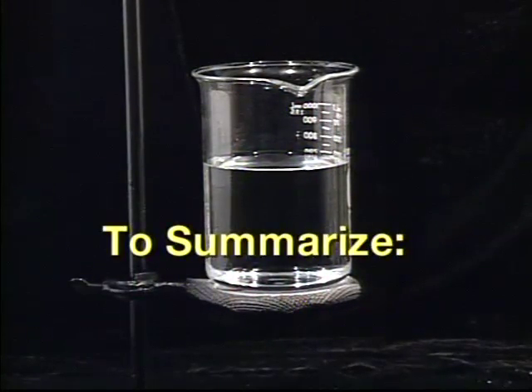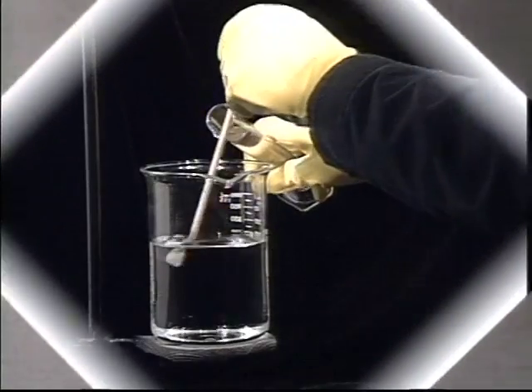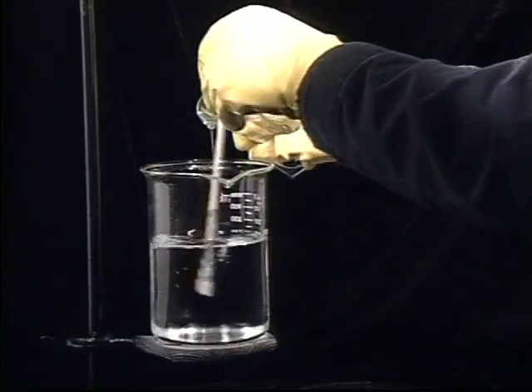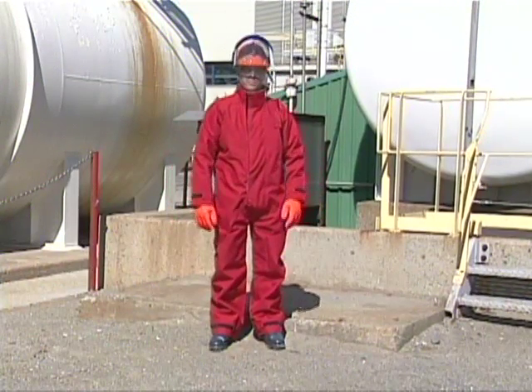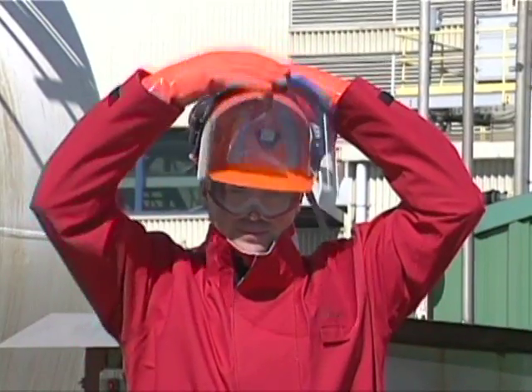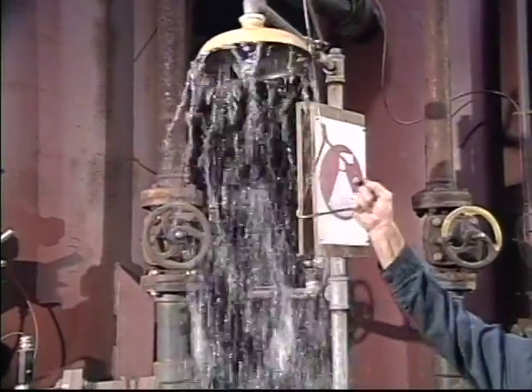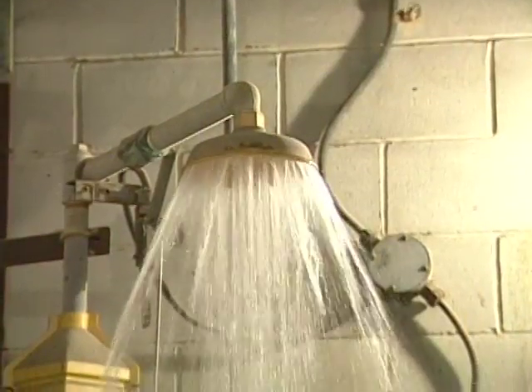To summarize, remember sulfuric acid is reactive and corrosive. Always add acid to water slowly while stirring. Wear complete personal protective equipment and wear it correctly. Cuffs and sleeves on the outside of gloves and boots. Full face protection. Check showers and eye wash stations daily. If splashed, wash skin and eyes for the full time. Get immediate medical attention.